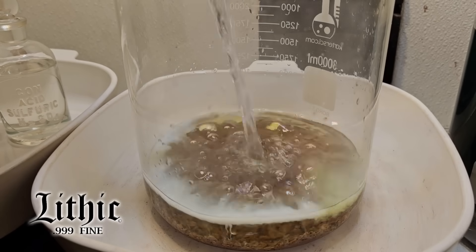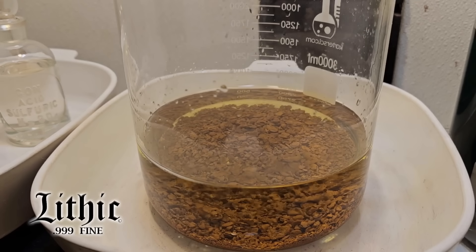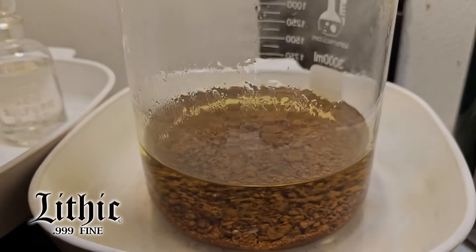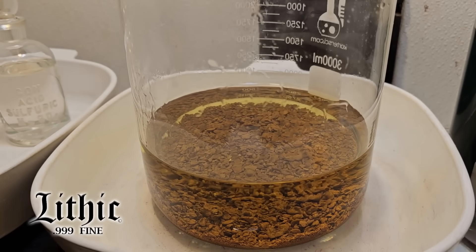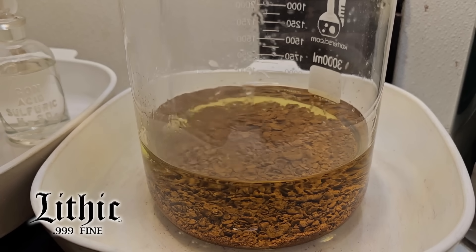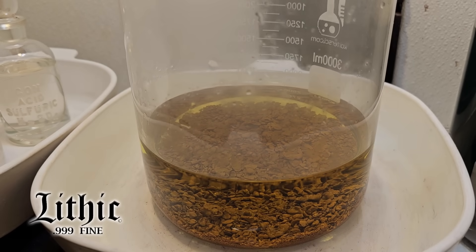Now I'm adding hydrochloric acid, and you see that reaction — it immediately turns yellow, which is an indicator that there are still free nitrates, and that gold immediately went into solution. That white frothiness at the beginning was a reaction to the traces of silver still in solution. So I already know I have traces of base metals in there that I have to get out.